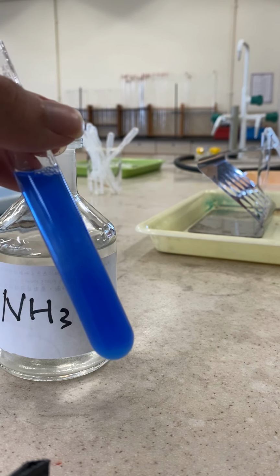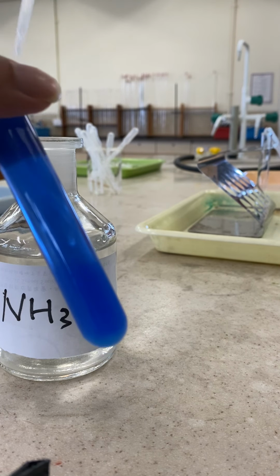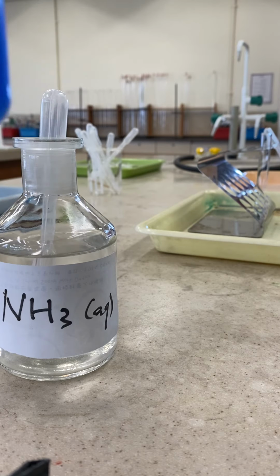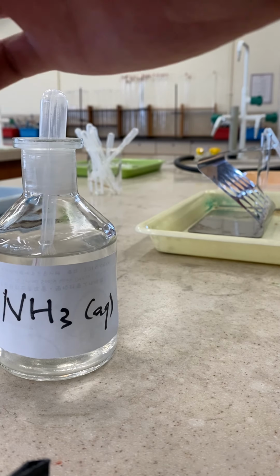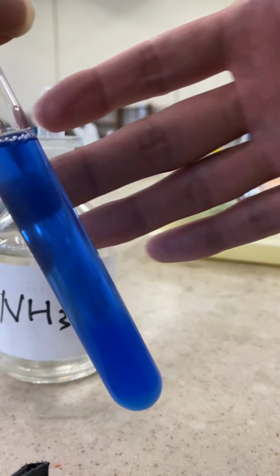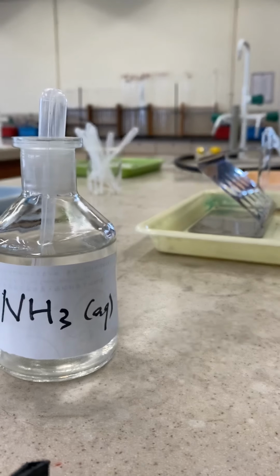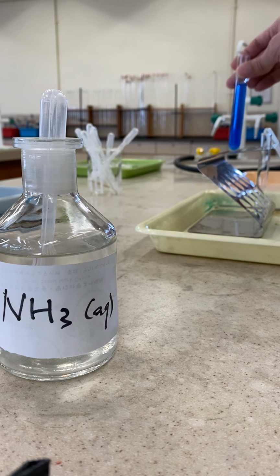The solution now becomes deep blue in color. Originally you described it as a milky solution, and now you can see through it again, it becomes a deep blue clear solution. So can you make the observation?